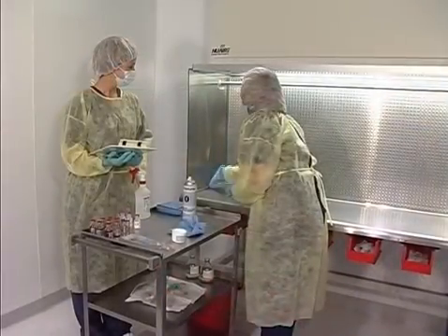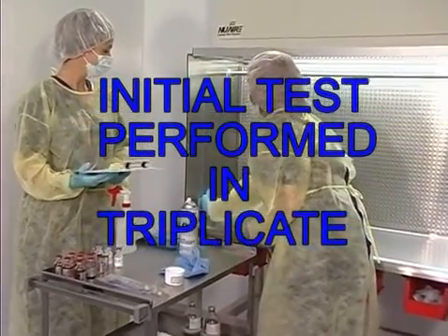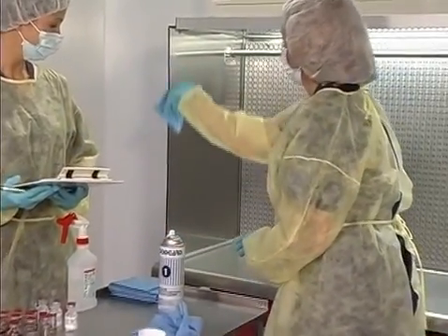For the initial validation, the test should be performed in triplicate when the candidate is most stressed or tired. This will normally occur at the end of the shift.